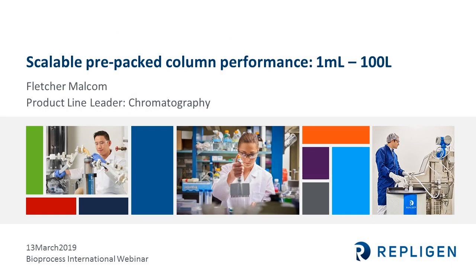Thank you, Leah. This is Fletcher Malcom with Repligen, and today's talk is going to focus on scalable pre-packed column performance from 1 mL to 100 liters. I focus on our chromatography products at Repligen, and have a long history with our Opus columns.